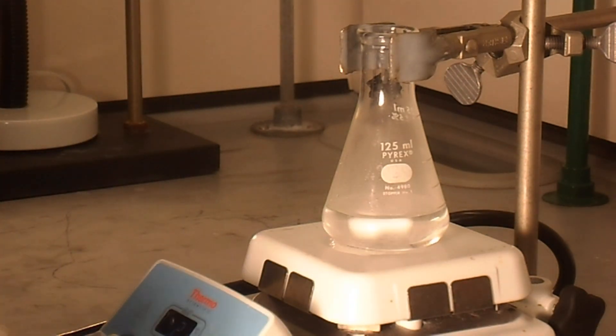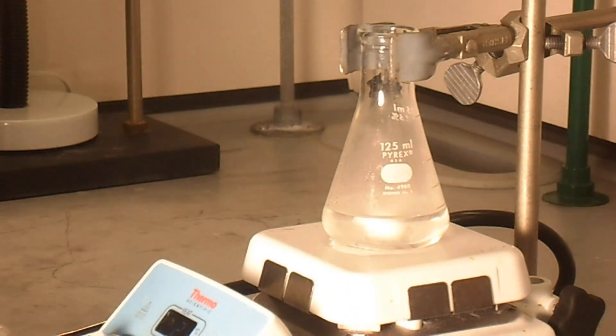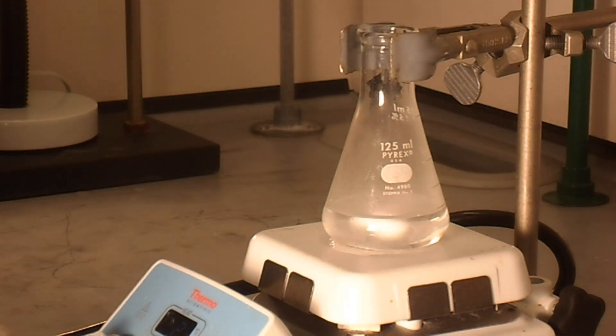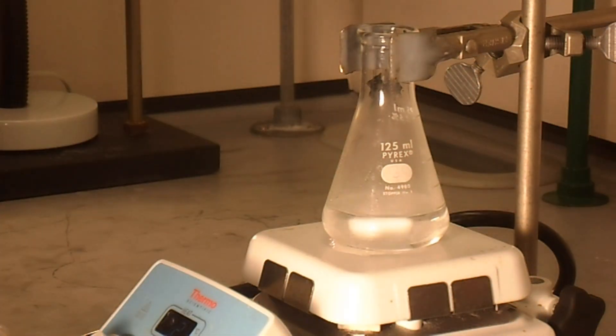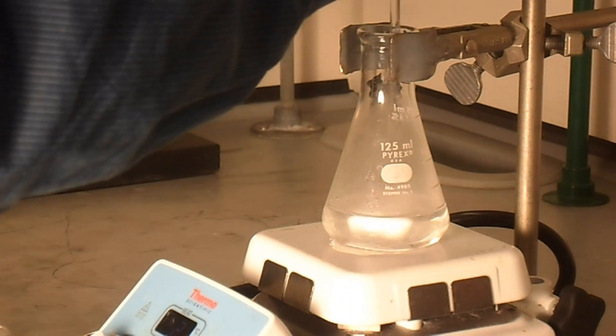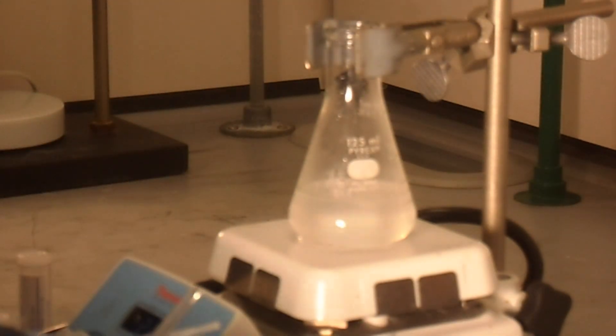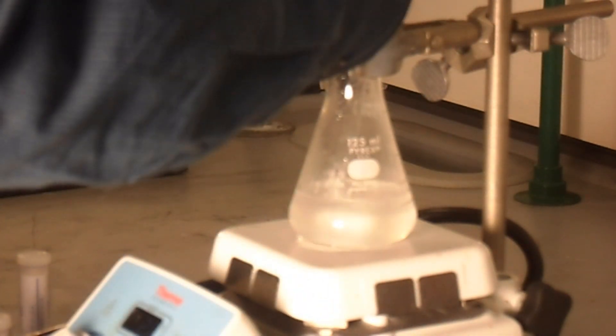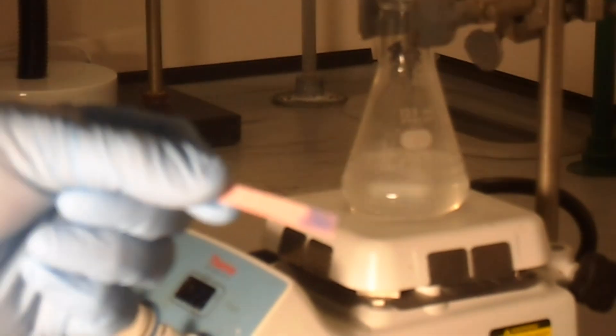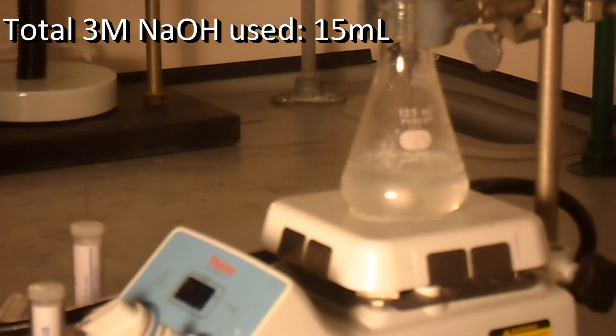So we can go ahead and move on to our 3 molar sodium hydroxide, which gets added 1 milliliter at a time until red litmus paper is basic. We have a clear test. There we go. So it's hard to see on the video, but basically the litmus paper has turned blue and we have used 15 milliliters of our hydroxide.